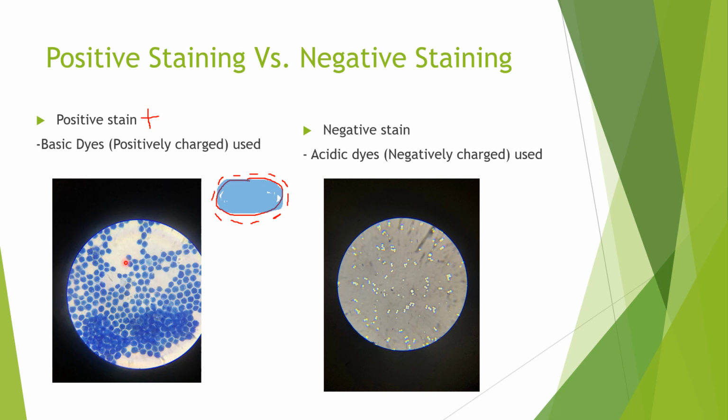See how you have a bunch of circular bacteria, and we use the term cocci, or coccus, singular; cocci is plural. So you see a bunch of cocci bacteria right here, and notice how the bacteria was the one that got stained, not the background. See how the background didn't get stained? It's the bacteria that got stained. And why was the bacteria absorbing that stain? Because the bacteria is negative and the stain that I used was positive, and so it got attracted to it.